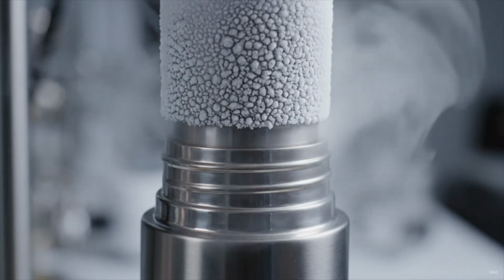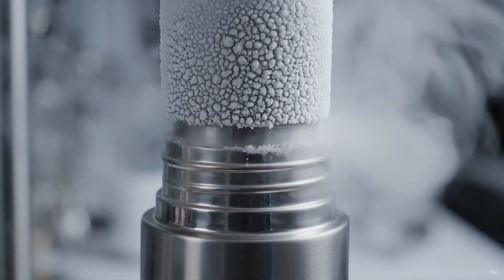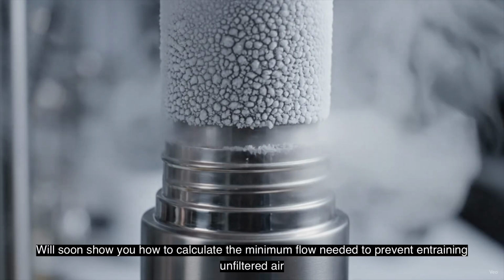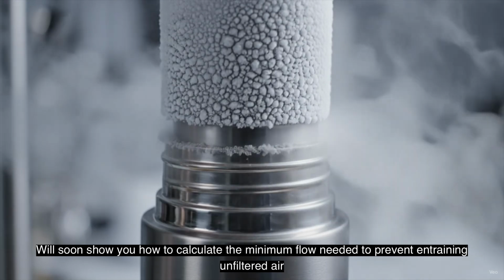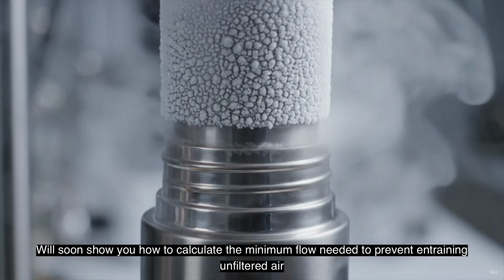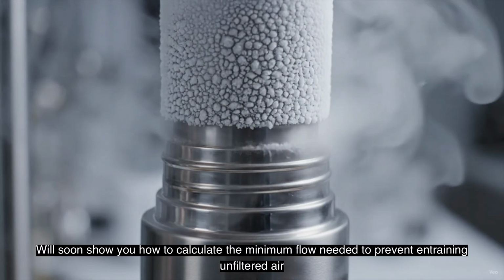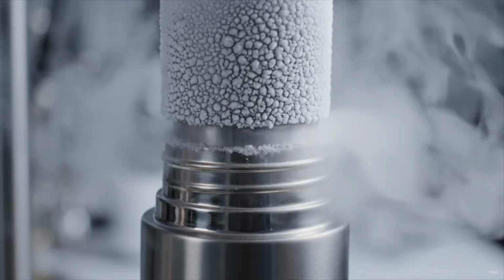What's going on? It takes about 700 cc's of nitrogen gas to make 1 cc of liquid nitrogen. So you can imagine that you've got your cryocooler liquefying the nitrogen in your thermos, and it's liquefying it faster than you can feed fresh gas, creating a vacuum, and you're actually sucking in room air, despite the fact that you have a flow of clean nitrogen gas going in.